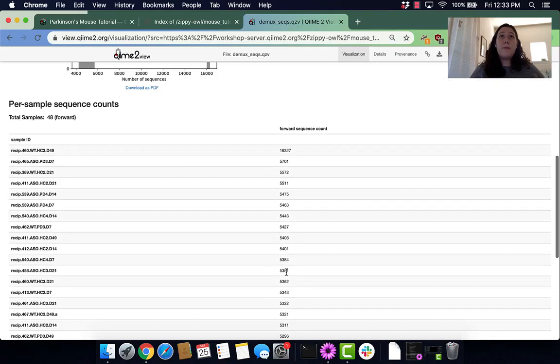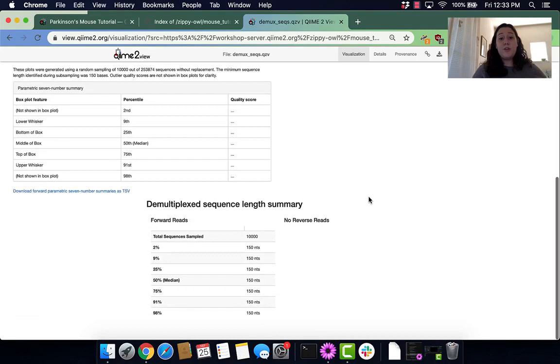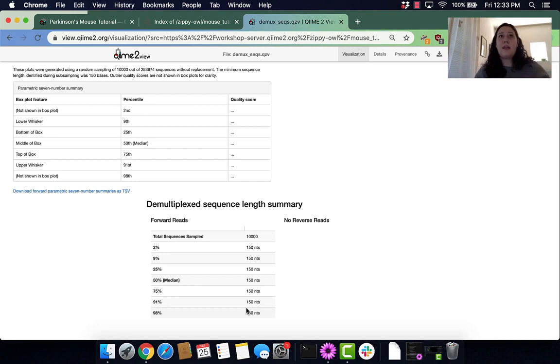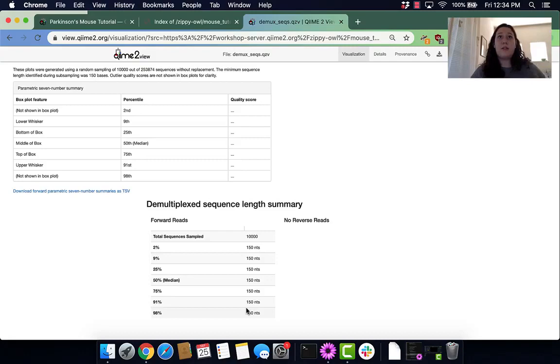What is the median sequence length? We can find that again on the interactive quality page where all of them are 150 nucleotides. So the median length is 150. This is pretty common to have all of them be the same length for Illumina runs, but it may differ if you use different sequencing techniques. Ours are specifically 150 nucleotides.